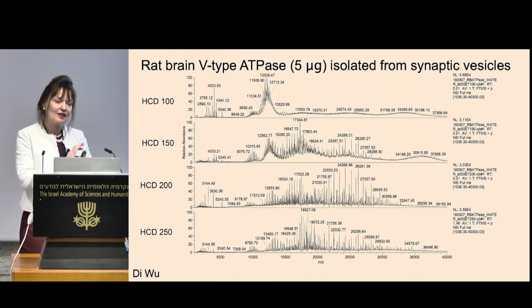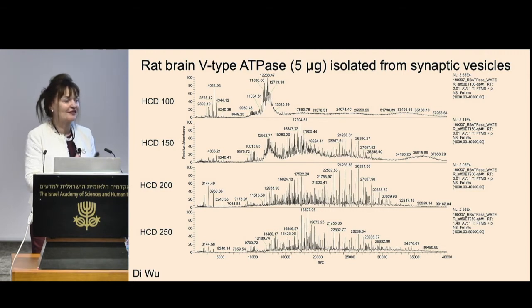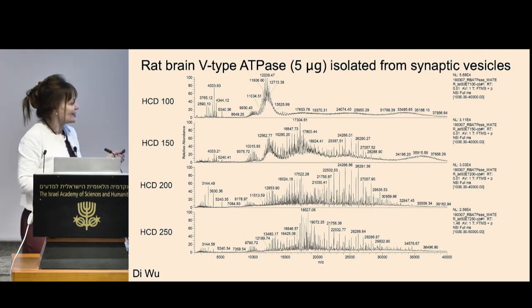But first of all, you would start with all the proteomics that you could do, all the lipidomics that you could do, so that you've really characterized as much as you possibly can. So you've got all the masses of all the pieces that are possible. And then this is the spectrum.